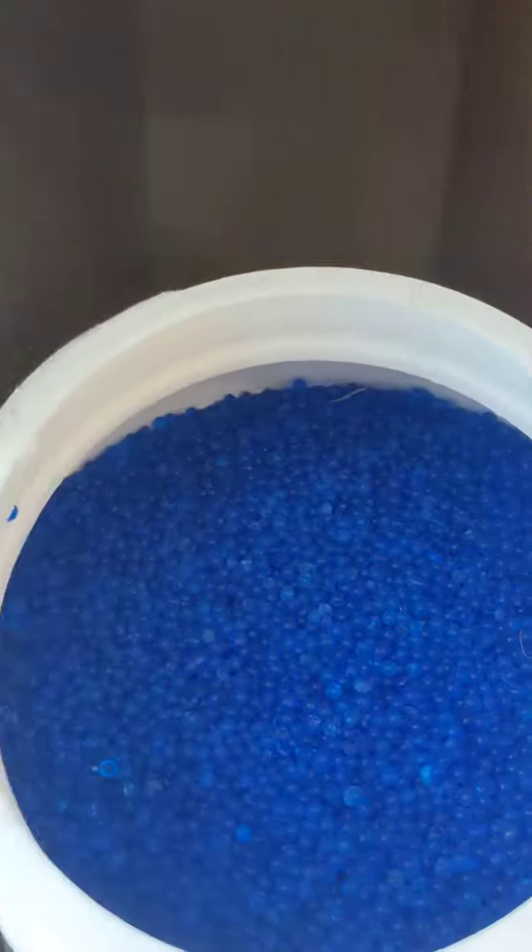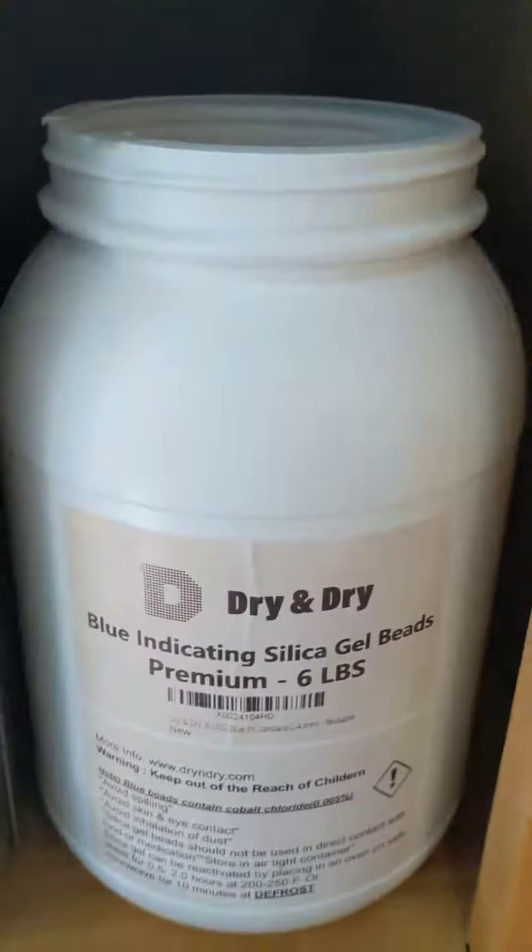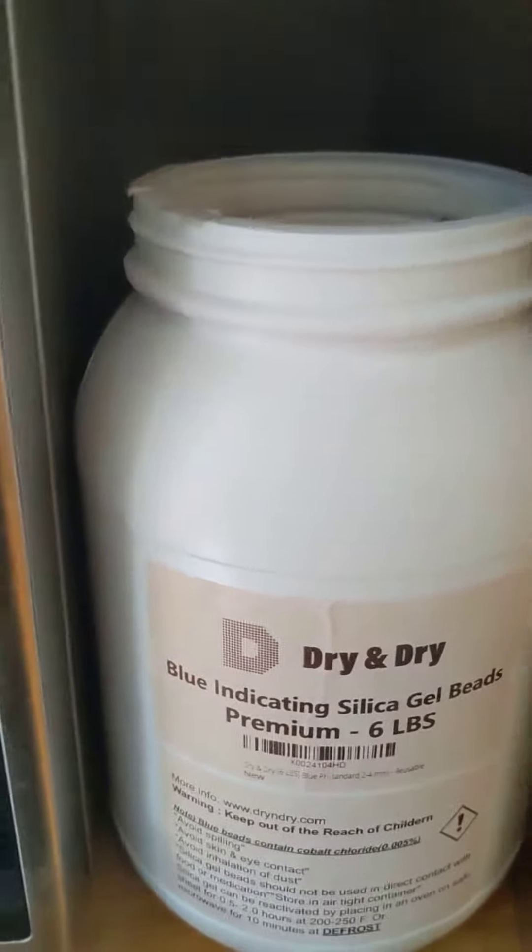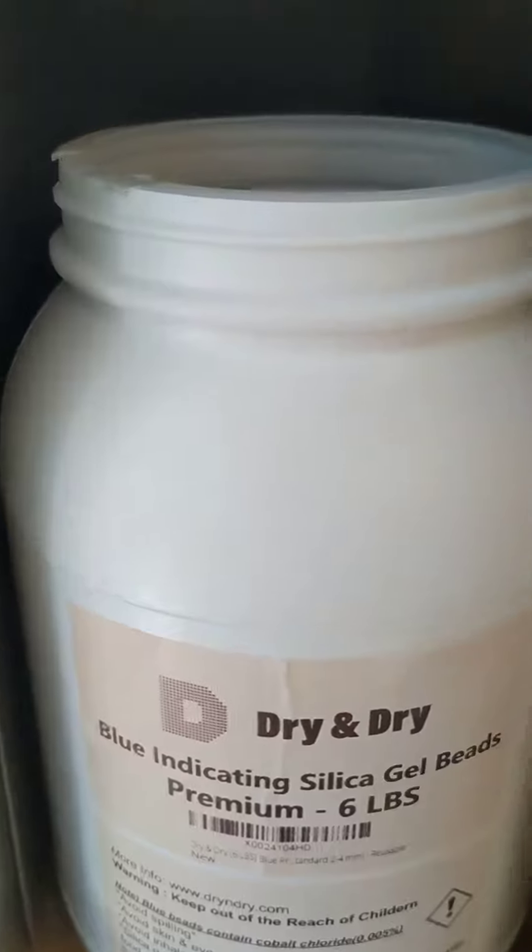You can see that when it's regenerated it's a dark blue color for this particular silica gel — that's the indicating type. If you can't get indicating silica gel you can just use the normal type of silica gel.